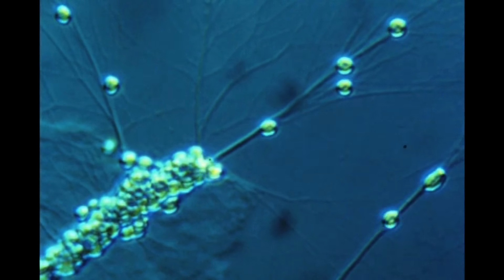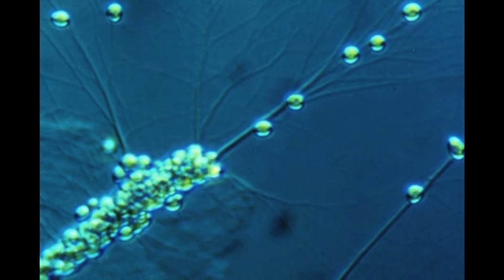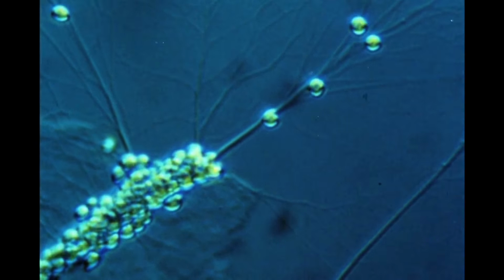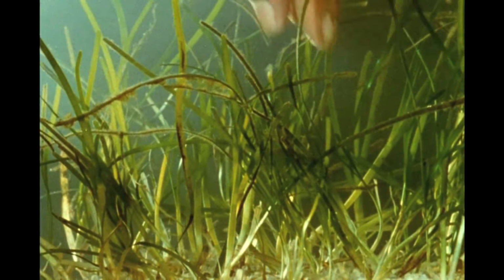Labyrinthula is a common marine microorganism found along the seashore, associated with various seaweeds or marine grasses, such as eelgrass, Zostera marina, from which cultures may be isolated.